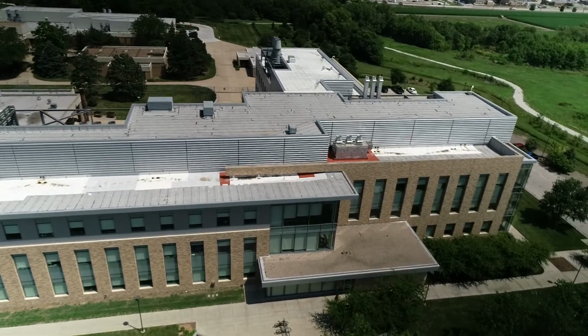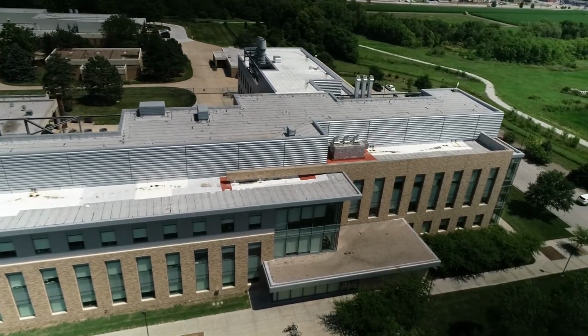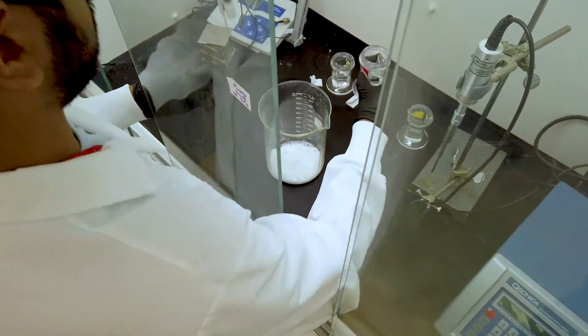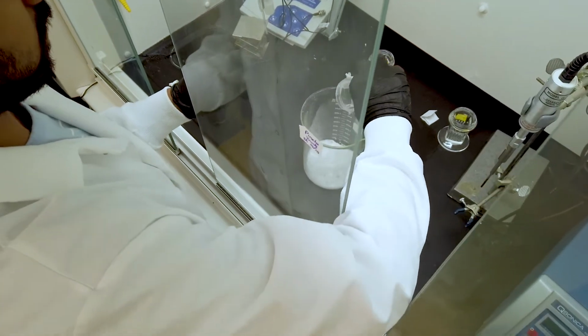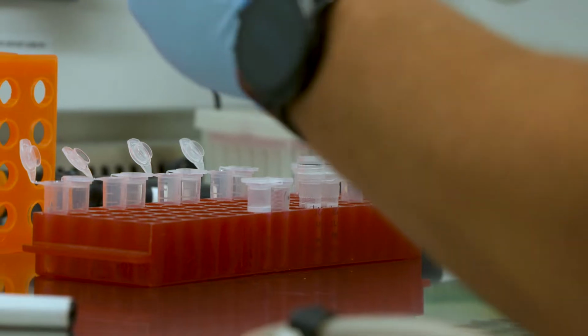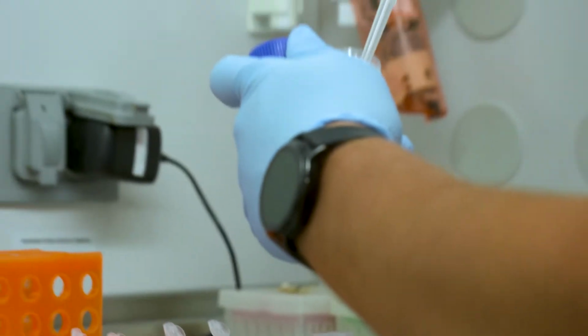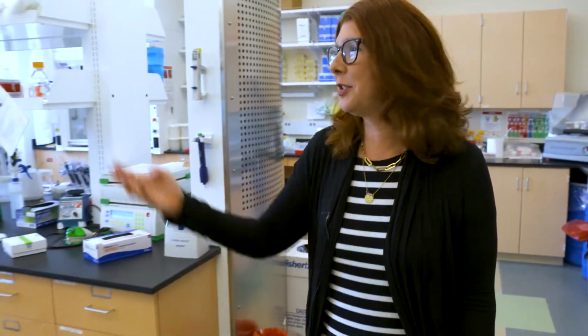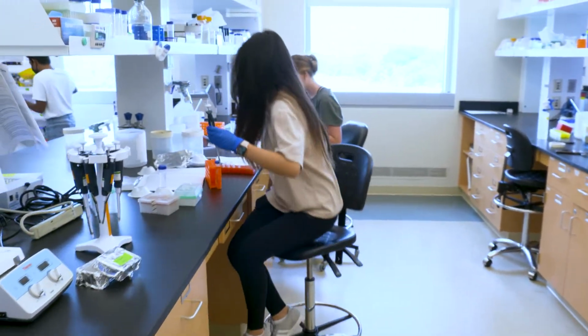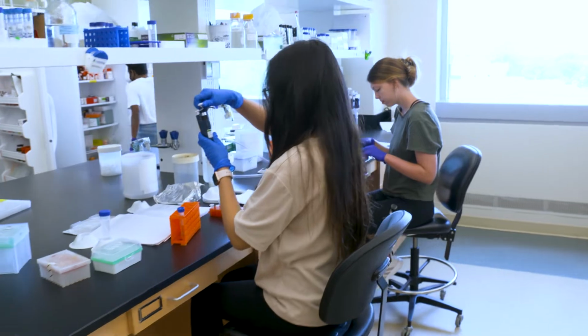Not only are we really fortunate to be in the 3rd floor of Morrison with window views of campus, but we have access to a lot of state-of-the-art facilities and technology here. And so we have fume hoods in every lab. We're able to have all of our instrumentation to make DNA and to prep cells. And so I just would like to highlight, we have a great amount of workbench space, and we are able to accommodate all of our students at individual benches, working on various technologies for stem cell applications and DNA delivery.